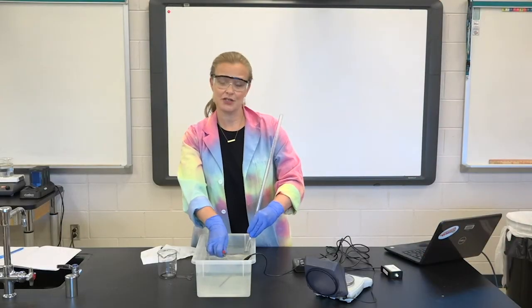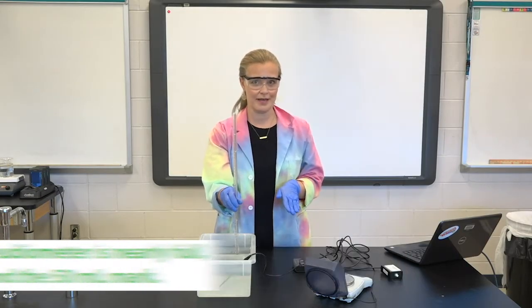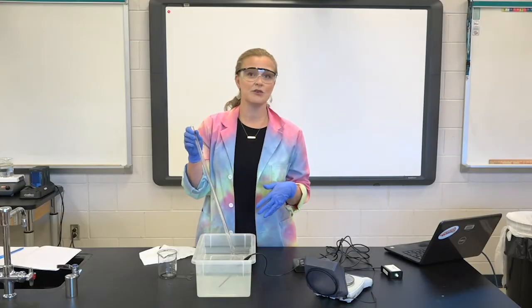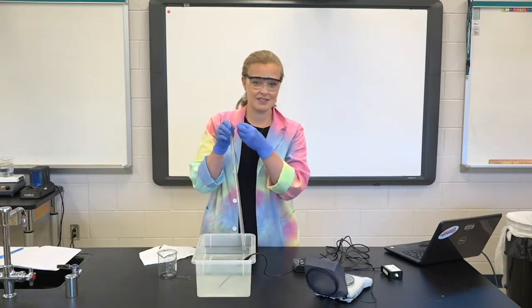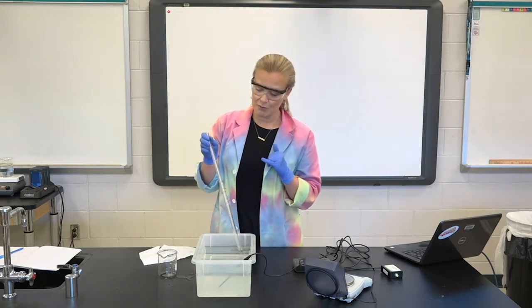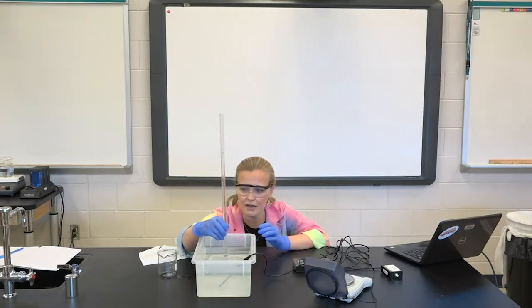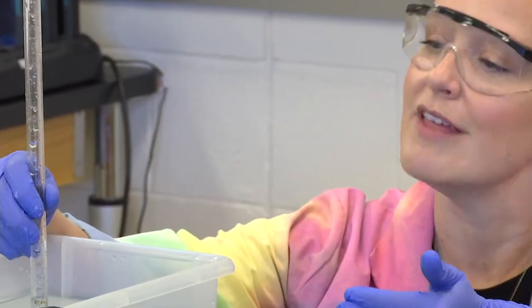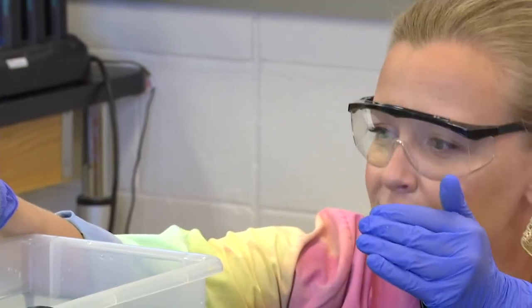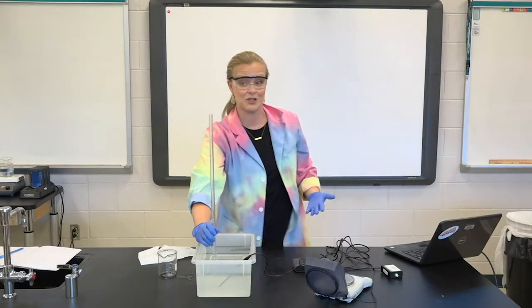I'm going to go ahead and stop here a little bit shy of the 50 milliliter mark. You can stop before the 50 — if you let it go past 50 you'd have to start all over again. The eudiometer tube works kind of like a graduated cylinder except it's a lot longer and skinnier, and instead of only having a mark every one milliliter, there is a mark every tenth of a milliliter, so it allows our volume readings to be a lot more precise. The volume of the gas we have in the tube is about 48.25 milliliters.